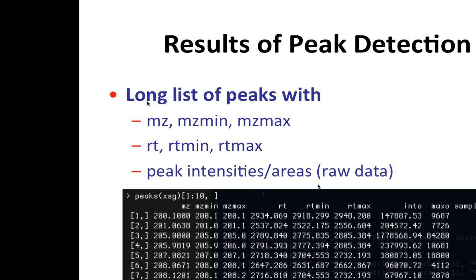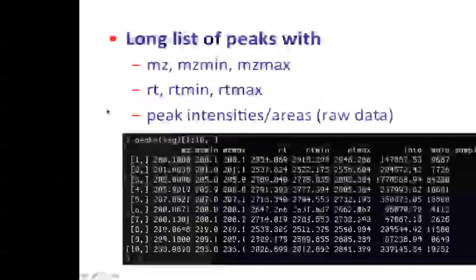These are the things we try to compare. In order to compare, we want to have the same m/z and retention time. We try to align all this and change the label to this one. But within the samples, there are actually certain ranges. That's why we want to do retention time correction and relabeling with the same number within this group. So now we can really see what's inside, and we are going back.